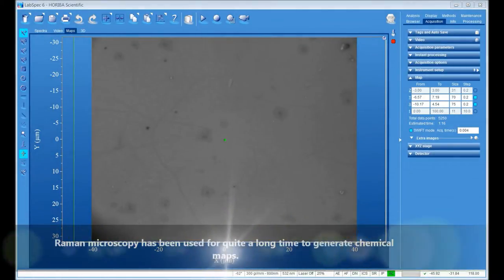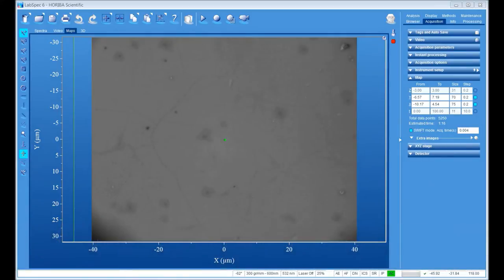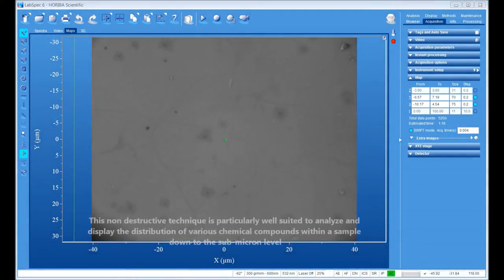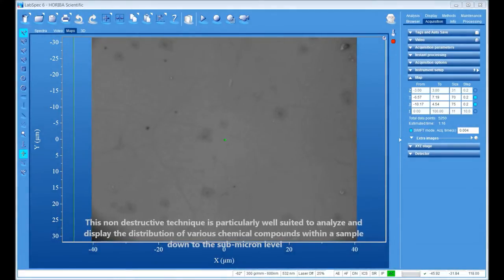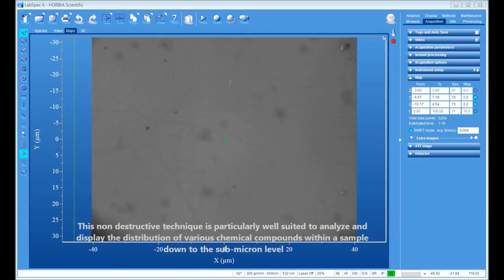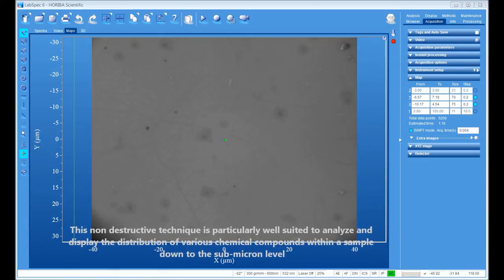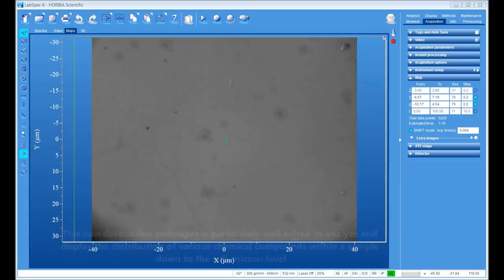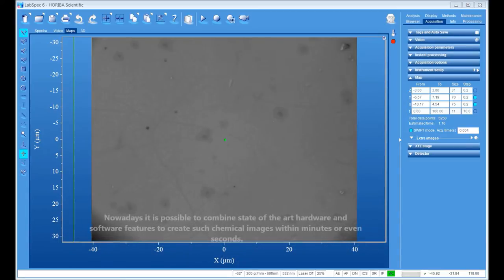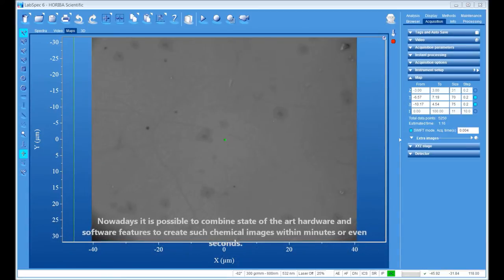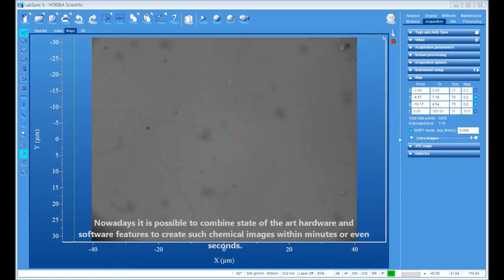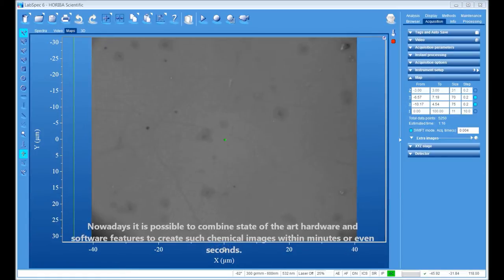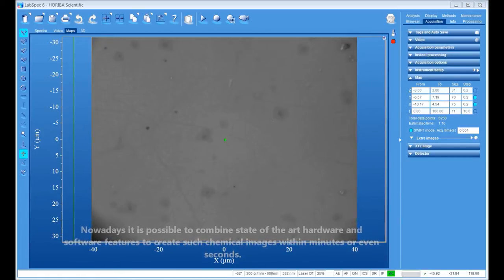Raman microscopy has been used for quite a long time to generate chemical maps. This non-destructive technique is particularly well suited to analyze and display the distribution of various chemical compounds within a sample down to the sub-micron level. Nowadays, it's possible to combine state-of-the-art hardware and software features to create such chemical images within minutes or even seconds.